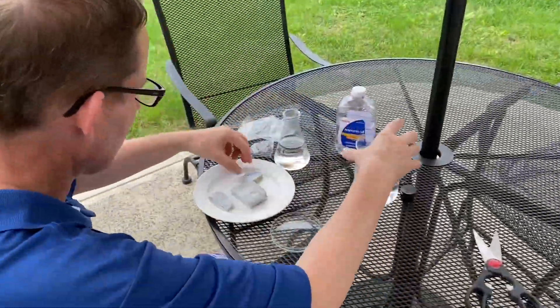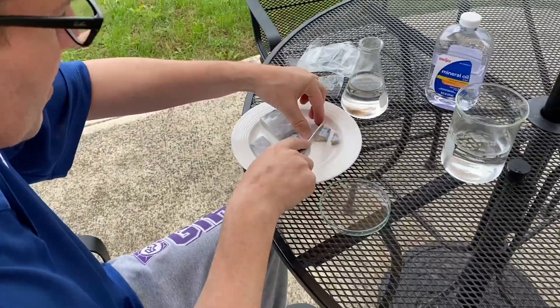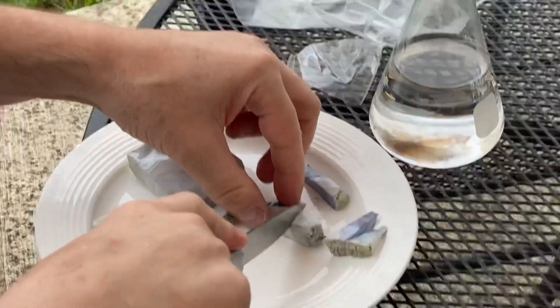The first step is you wanna cut your potassium into small pieces that you can put in your mineral oil. Very easy to cut. And you see that bright silver that doesn't have an oxide layer yet.